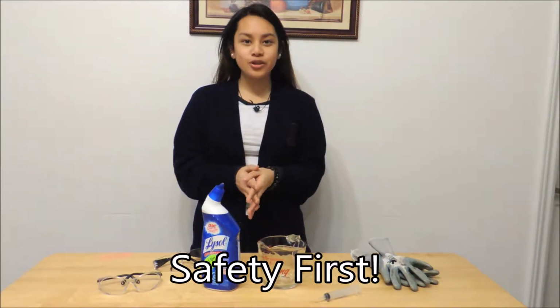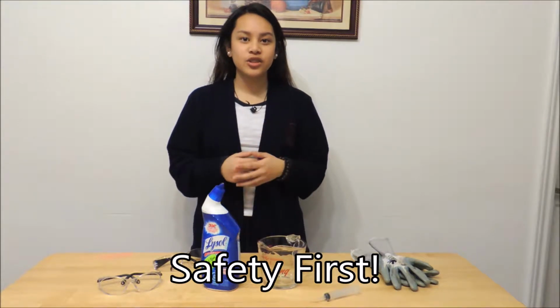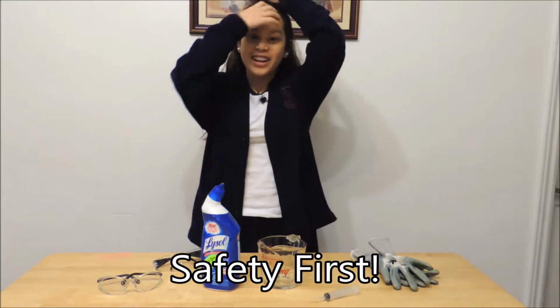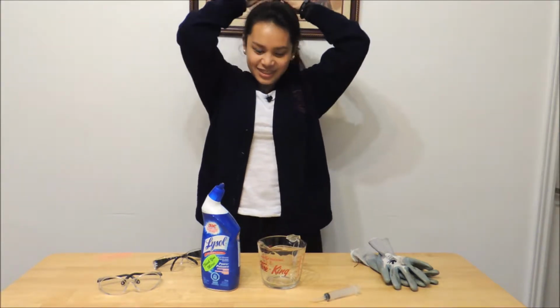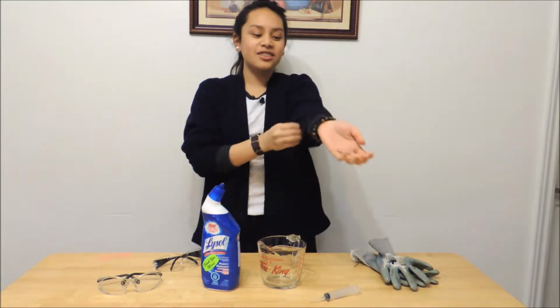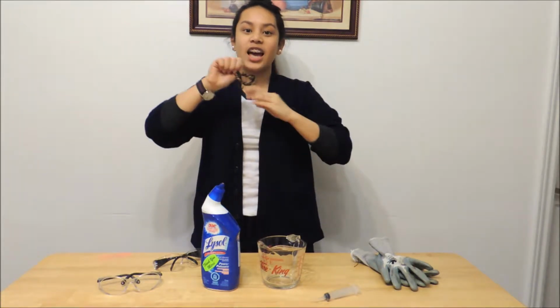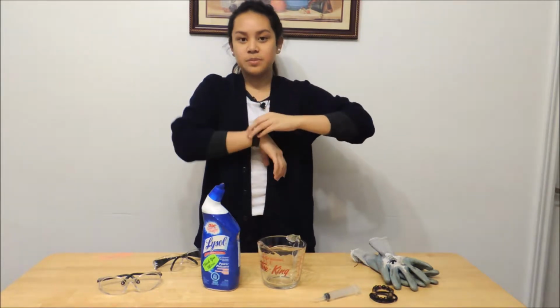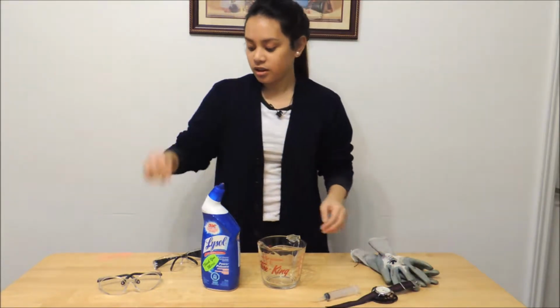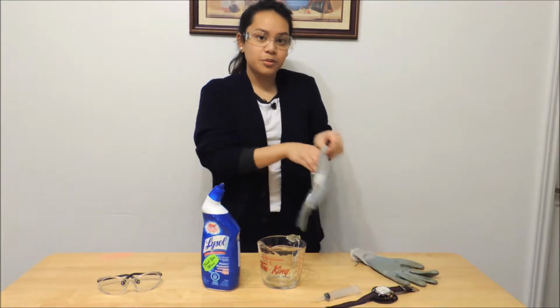So don't forget, before you start your experiment, to practice safety rules. Tie your hair. Roll up your sleeves. Take off any excess jewelry. You don't want it in the way of your experiment. Put on your goggles. Put on some gloves.